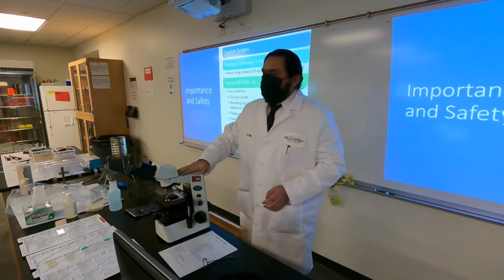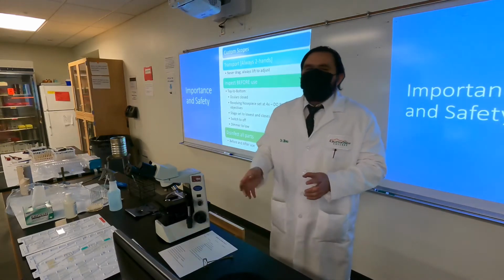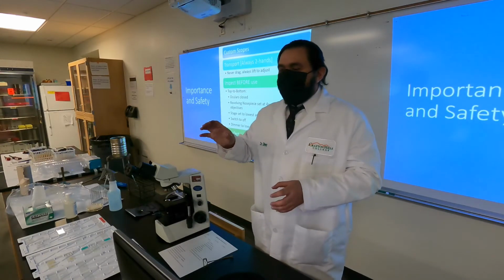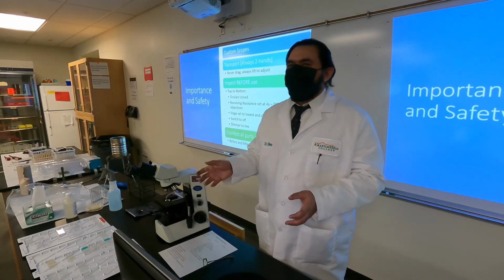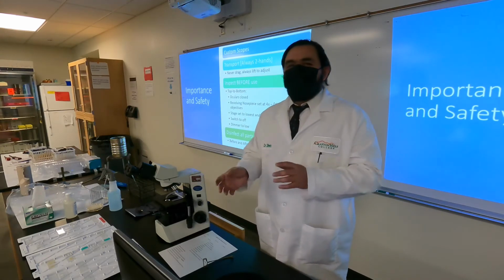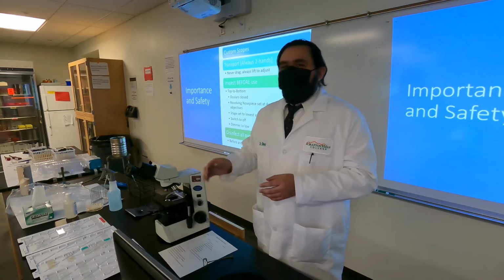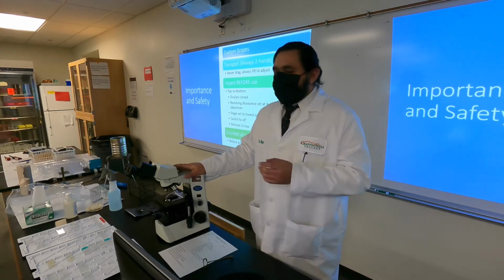These are custom scopes, and even though our cool little Olympus scopes here, usually most of these you can buy from a couple of grand, $2 to $3 grand, specifically have been designed to be customized so that the lenses that we have do it to about 15 grand. And then each of the objectives that we have here will go between $500 to about $2,000. So unless you're planning on buying me a new car, I encourage you to take care of these really, really well.